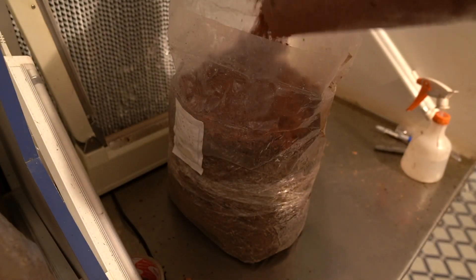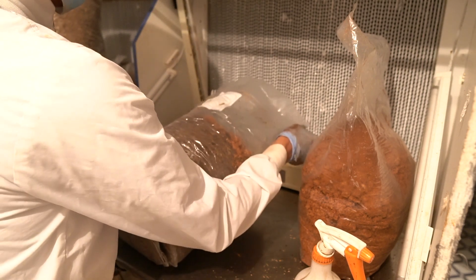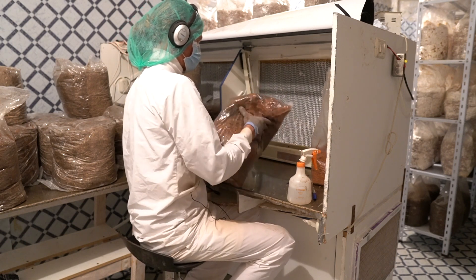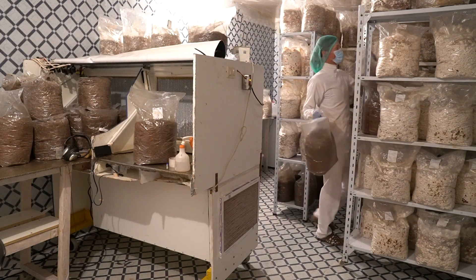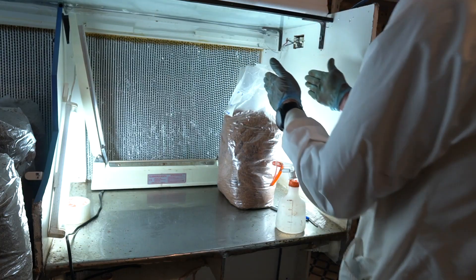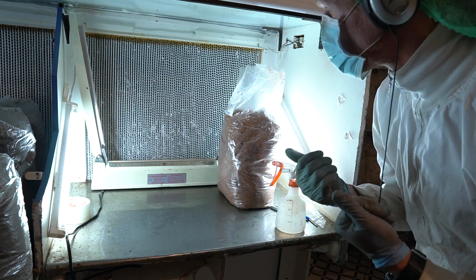They have found laminar flow hoods to be better than glove boxes. The idea behind glove boxes is you nuke everything inside and work in stagnant air, but they found it a lot better to just push clean air over a surface. Basically the technique is that I think of myself as dirty, and everything in front of me — in front of the flow, upwind of me — is clean.